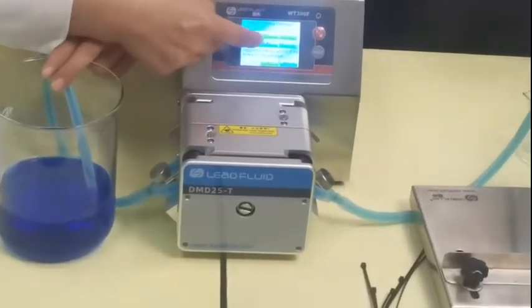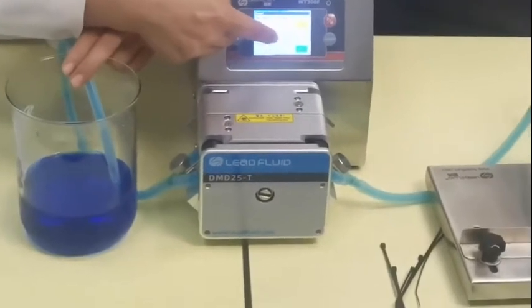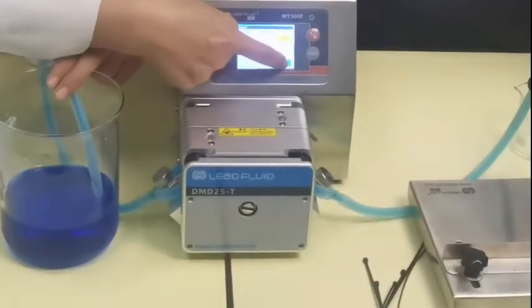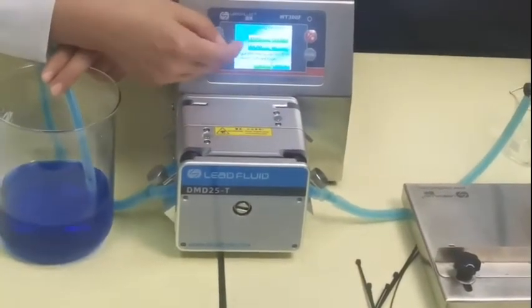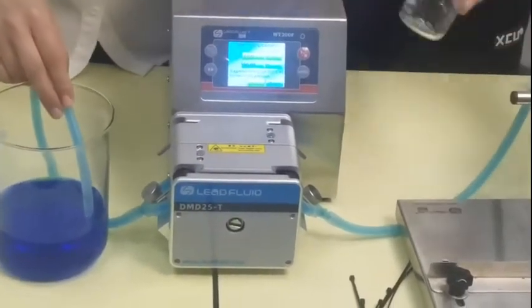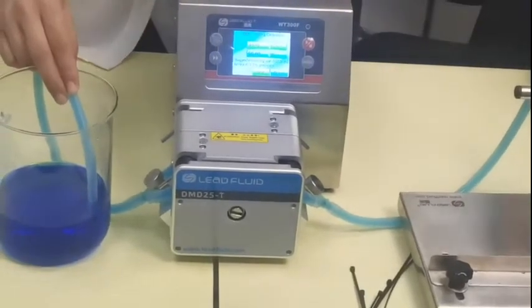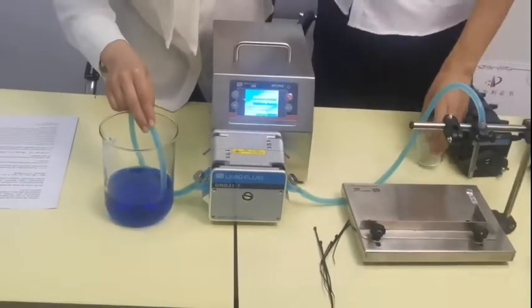And calibrate — maybe it's 100 or 50. We can calibrate 50, okay? Maybe 60 is easy for us to read, okay?